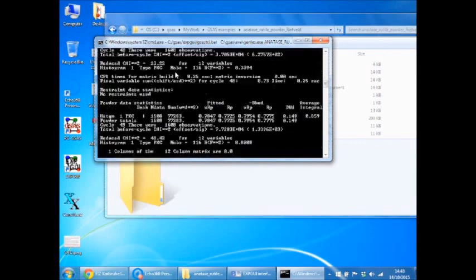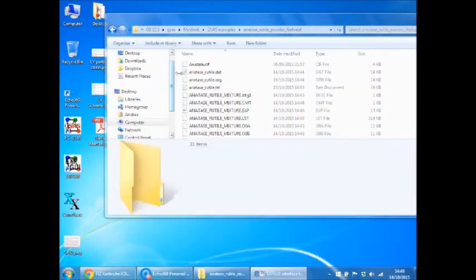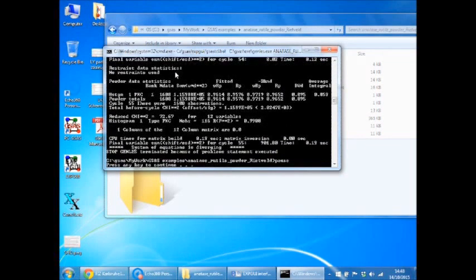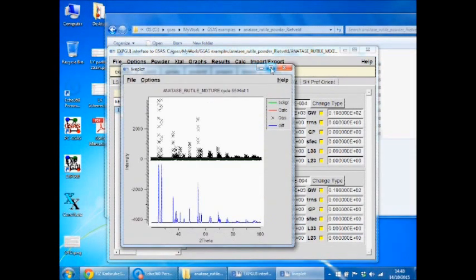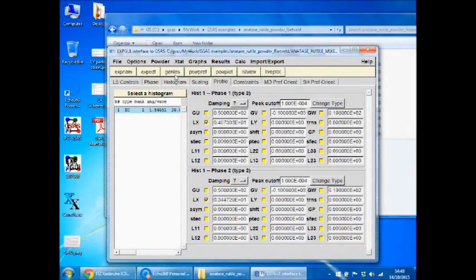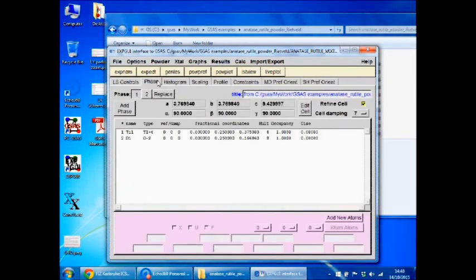Oh, it's gone a bit weird. That's fine now. For some reason it's going very strange at the end. What's going wrong? I guess I have too many things checked.